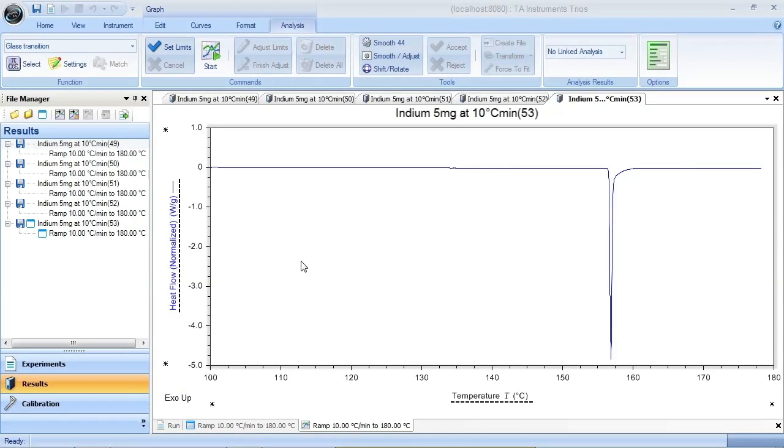Analyzing within an overlay makes it easy to repeat analyses using identical limits, a key factor in maximizing the repeatability of your measurements. I have here a set of Replicate Indium Melts, a typical experiment we use for verifying the performance of a DSC.